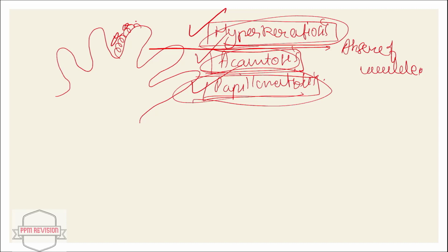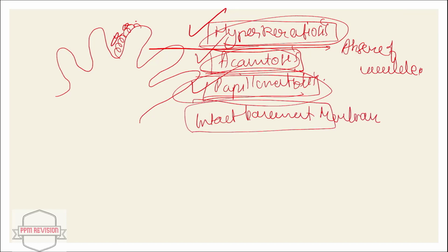Now just moving ahead with the points we can find under the squamous papilloma. The papillary, that is the finger-like proliferation of squamous epithelium of the epidermis with intact basement membrane of basal cells. So there's intact basement membrane that is found. And looking at the central vascular connective tissue core with a sprinkling of round cells. There's a sprinkling of round cells as well.